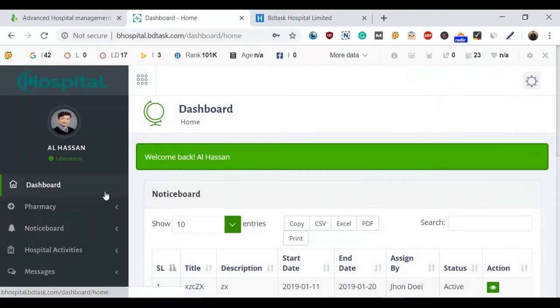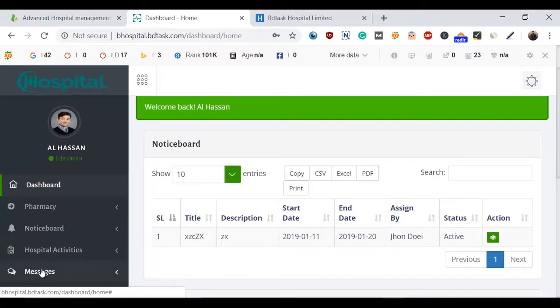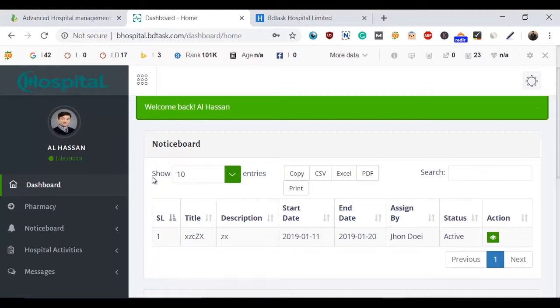Basically, laboratorists are assigned by the admin and hospital admin. The head of the administration will assign the work for the laboratorists. Mainly, laboratorists handle the departments of tests like X-ray department, pathology department, and blood bank. They will manage all those departments assigned by the admin.